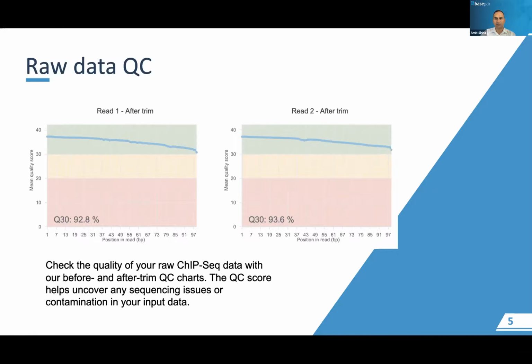If you compare to the figure on the right, you see that the base quality at the 3' end is a few points higher because the poor quality bases have now been trimmed away. So it is quite common, although as you can see, the difference is small. Trimming the bases should not have any material impact on the results of your analyses.